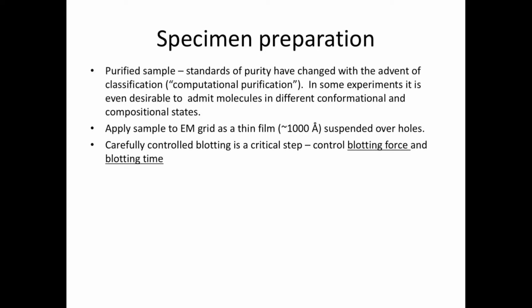So then carefully controlled blotting is a critical step, because with the blotting we want to aim at getting this kind of thickness. So we want to have control over the blotting force and the blotting time. And obviously that's very difficult to do if we use manual blotting.